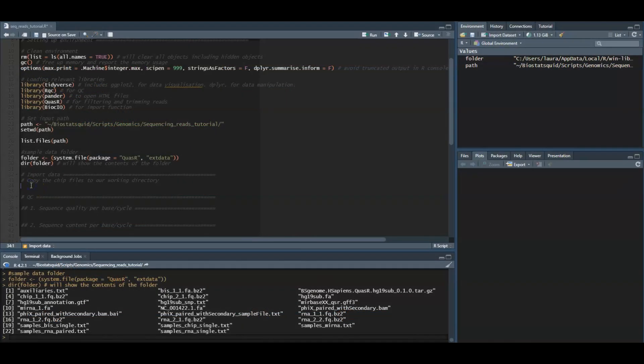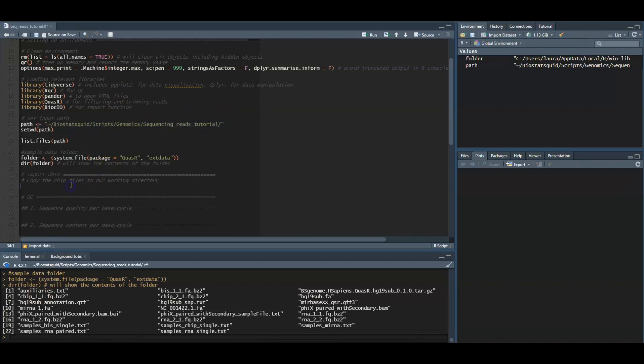We start the example workflow by copying the files we need from the sample data folder to our current working directory. Of course you can just copy the files manually, but we will just do it with a bit of code here.